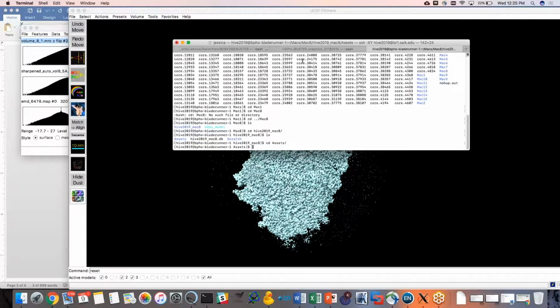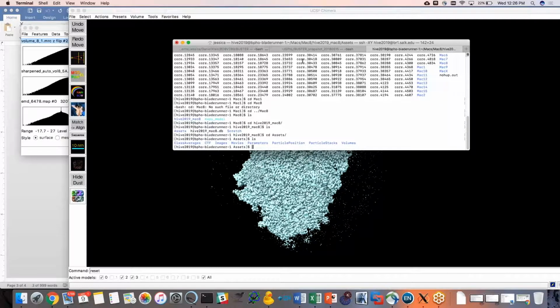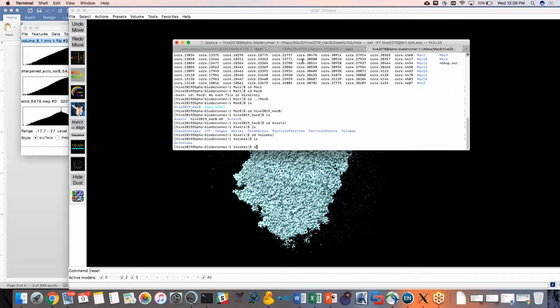Should we get a few people running refinement from a good and a bad ab initio? Yeah. And that should finish it up, I think, right? Yes. I'm not sure how they can. Let me see what they look like when the job is not actually done. But I still don't understand. I don't think you should be able to run a refinement even if you don't have an ab initio finished. I don't understand why you can't do it at the same time. They're two different processes. I would think so, but they just crash, yeah, crash the database?